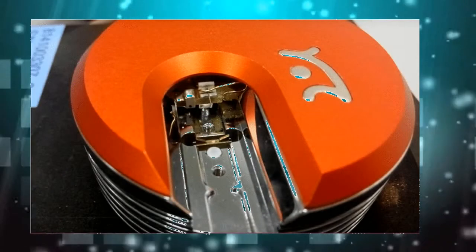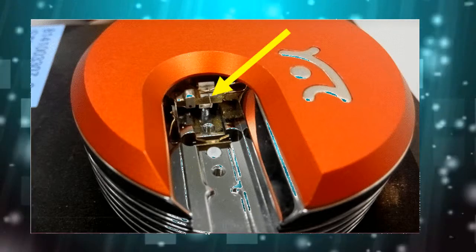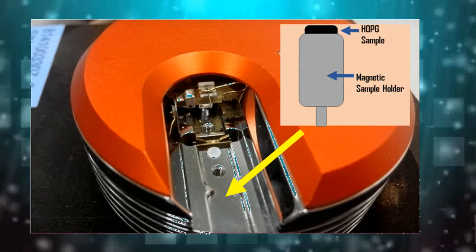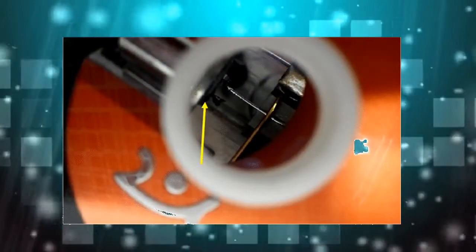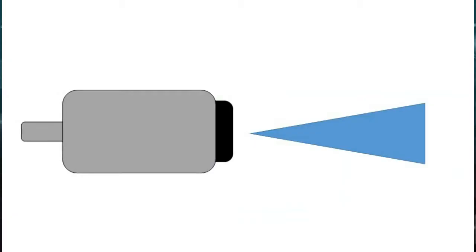This is the scanning head in which we will be placing the tip and the sample. The arrow indicates the position where the scanning tip is placed. The HOPG sample will be placed on the magnetic sample holder and placed in the area shown. This is the final setup at the scanning head. Looking through the magnifying glass, we can see the tip and the HOPG sample. They have to be very close to each other, but yet not in contact. With that, we need to use the software to bring the tip and sample closer to each other.